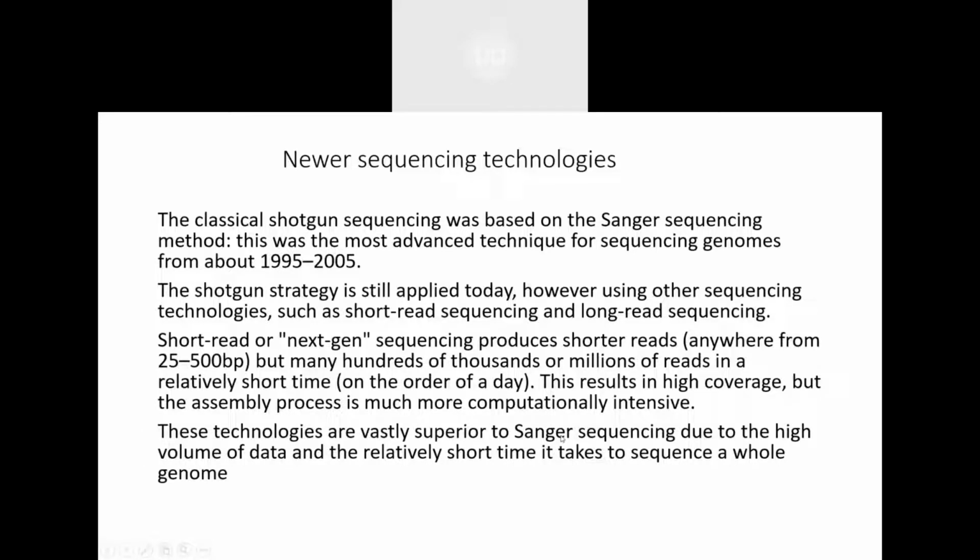Now, Sanger, which I've mentioned in my first slides. So these technologies are obviously much superior to Sanger sequencing due to the high volume of data and the relatively short time it takes to sequence a whole genome.